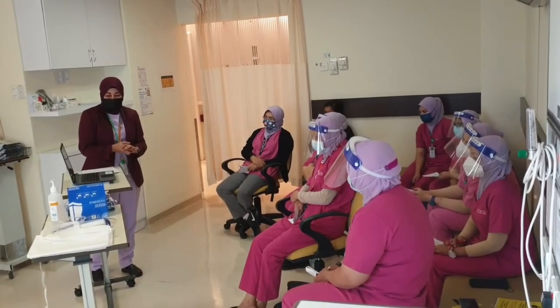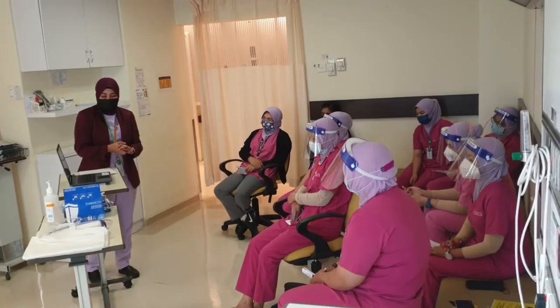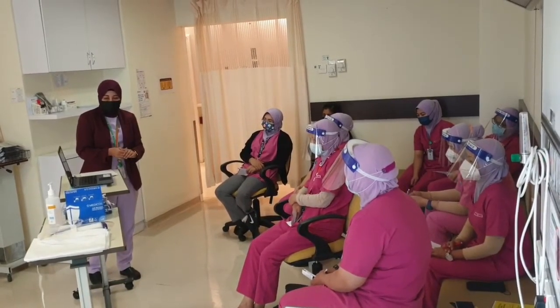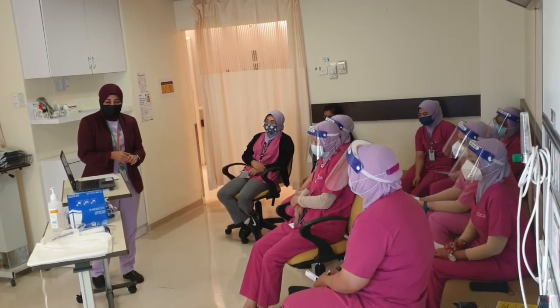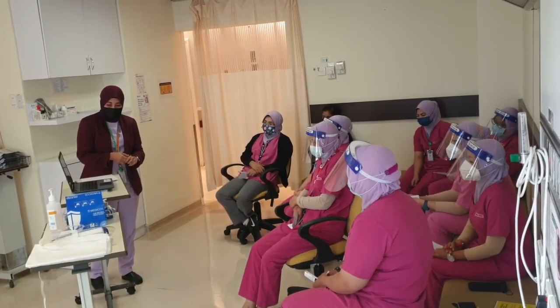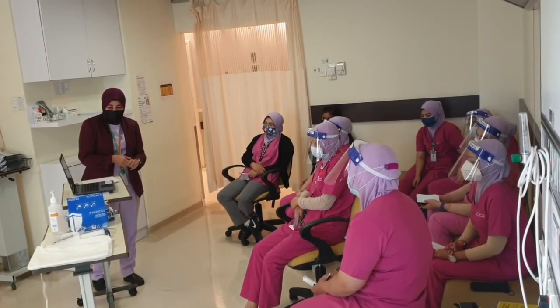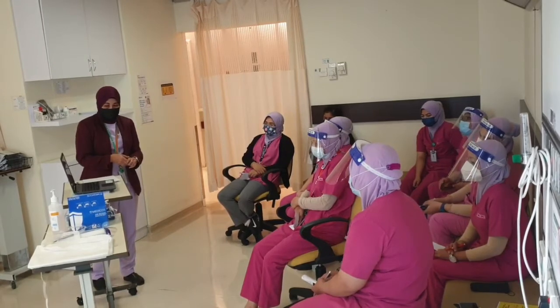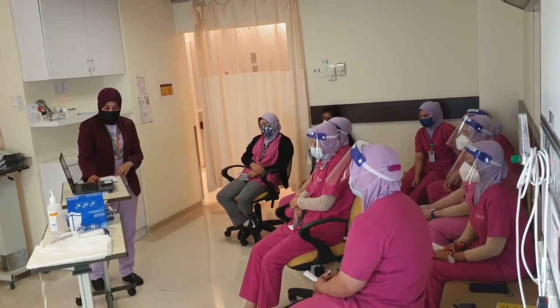Use your gloved hand to grab the palm area of the other gloved hand and peel off the first glove. Hold the removed glove in your gloved hand. Slide the fingers of your ungloved hand under the remaining glove at the wrist and peel off the second glove over the first glove. Then discard the gloves in the waste container.